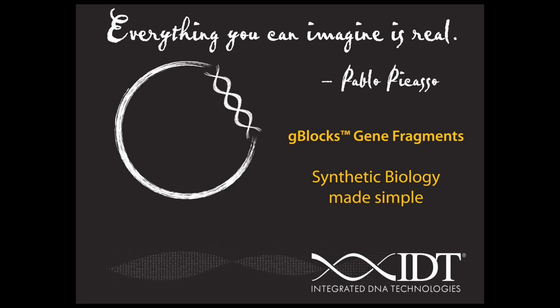Yeah. So in pretty much all cases, we don't clone into specific vectors. We just clone into our in-house vectors. Our in-house vectors are very generic vectors. They are, in most cases, pUC-based vectors that we have stripped down and made as simple as possible. And we make that as basically something that can then be subcloned into any other vector. We try and do this to keep costs down and to keep our turnaround time quick, and also to minimize the amount of failures. It takes us a lot of time to optimize vectors that come from the outside into our manufacturing process, and so we've pretty much stopped accepting vectors.